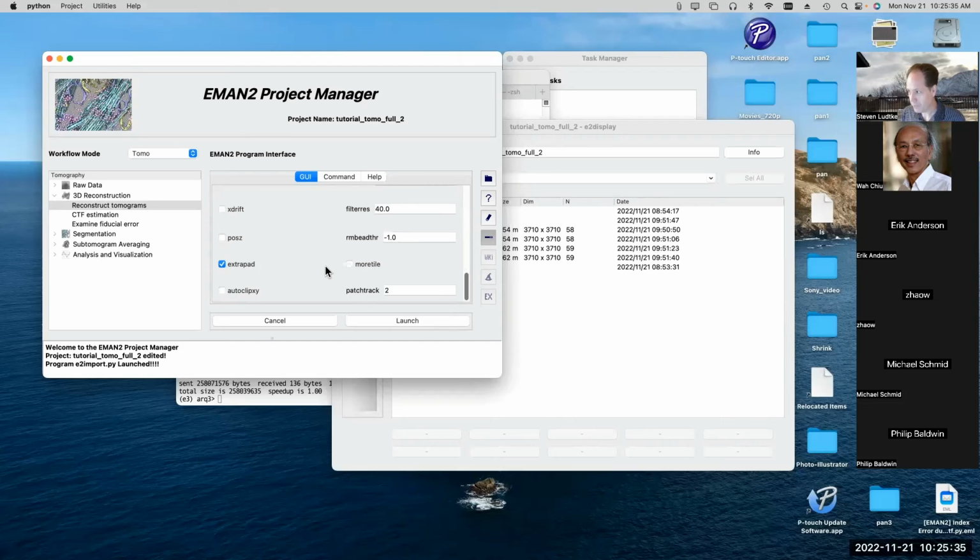If you look in the main part of the tomogram, you can see the same features here as you see here. So I think statements like that are mostly figments of the user's imagination, because they're used to looking at things that are flat in real space but have Fourier artifacts, rather than things that are flat in Fourier space but have some real space artifacts.